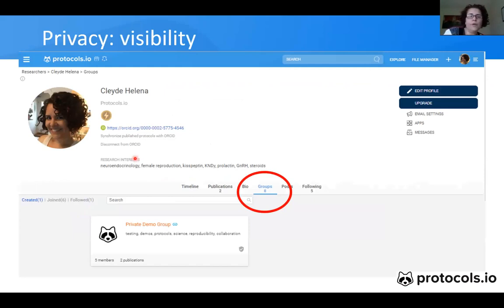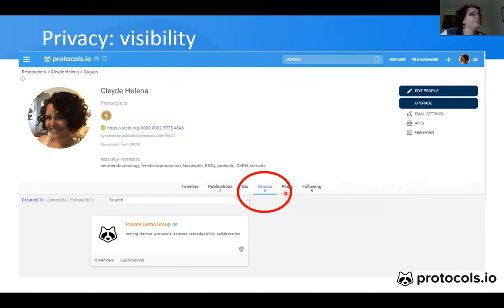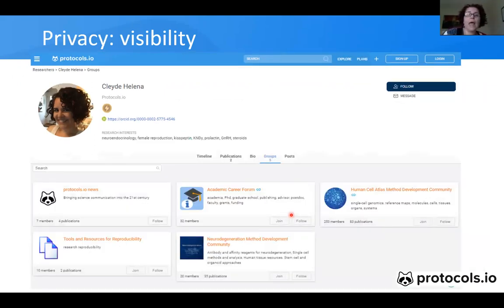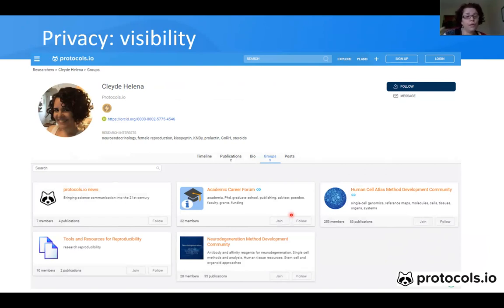Regarding privacy and visibility: private groups are not only private but invisible. This is my profile page as it looks to me — I know I am a member of eight groups. However, if I sign out of Protocols.io, this is the page that others can see. People are only able to see the groups that I'm a member of that are public. All other groups that are not public are not even visible to others.